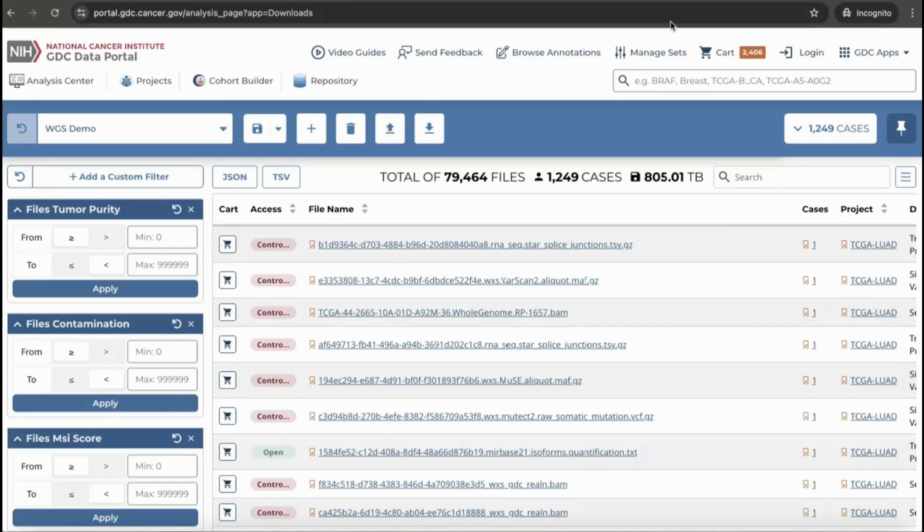If you are interested in that, you can look into some of the papers the GDC have published, including the original paper that compared HG19 and GRCh38 data. That's probably something we will also do once we have collected enough whole genome variant calls.